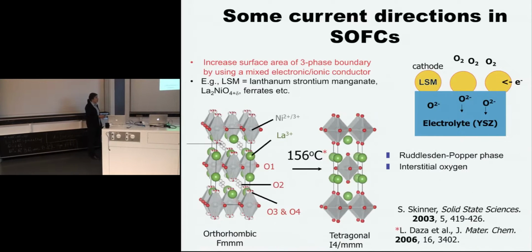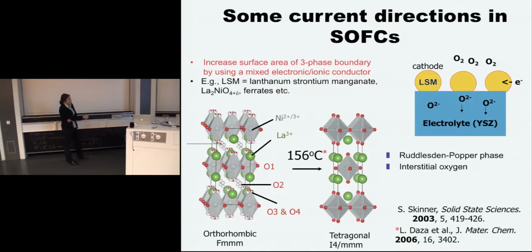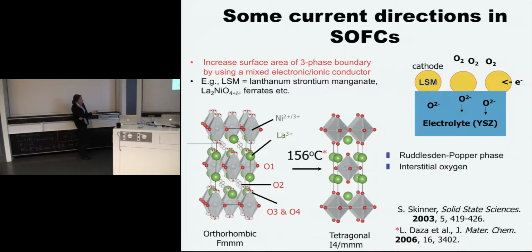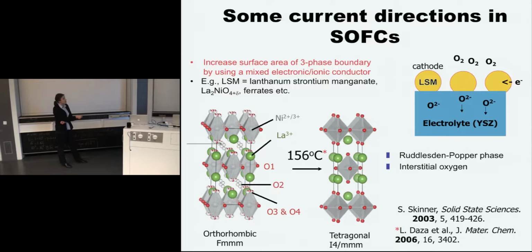So when we now move into a paramagnetic regime, we're going to have to deal with the interaction now of the paramagnet with the nearby oxygen, and the spectra are going to become a lot more difficult. So to attack this problem, we looked at this Ruddlesden-Popper phase, the lanthanum nickelate. So this material contains perovskite layers with lanthanum oxide layers in between. And the reason we chose it was that in these lanthanum oxide layers, you have oxygen environments that are only coordinated to lanthanum in the first coordination shell. So they would look diamagnetic. And so we thought we would stand at least a chance of seeing those ones, even if we couldn't see the oxygens in these mixed nickel-2, nickel-3 layers.